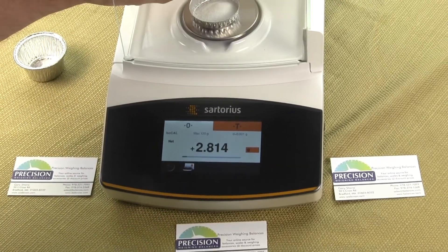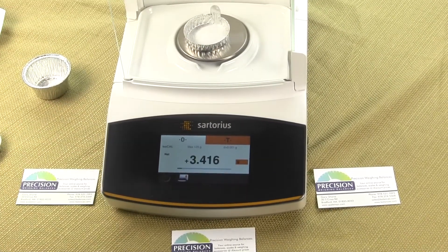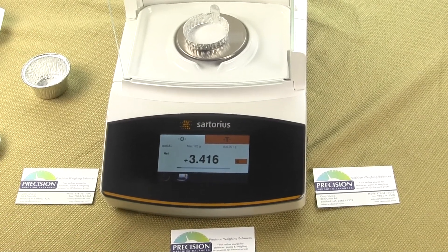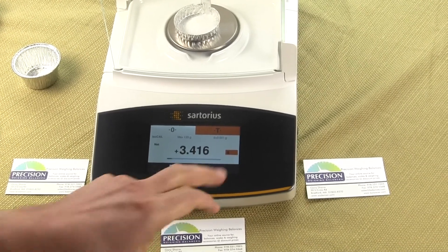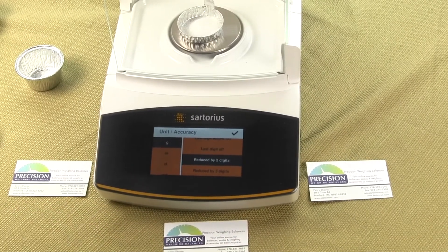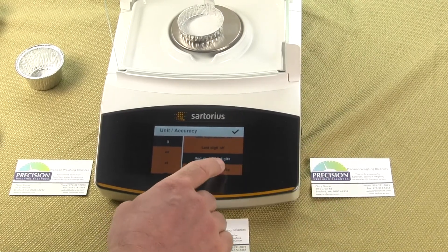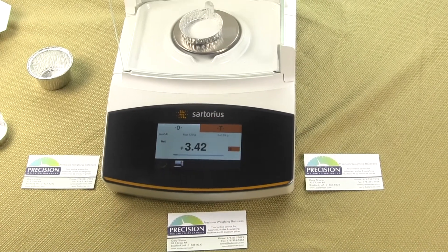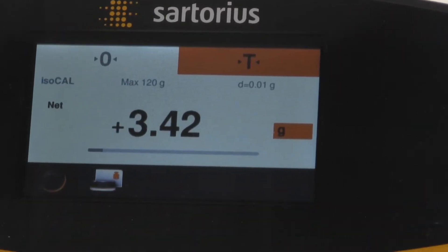Now we can pour more sample on, and you'll notice we don't even really need to close the draft shield at the milligram level. All of the Sartorius Quintix, Secura, and Practum balances have the ability to drop or reduce the number of digits — you can reduce the last digit, reduce by two, or even reduce by three. So this is a five decimal place balance, but now we've just changed it to a two decimal place balance.